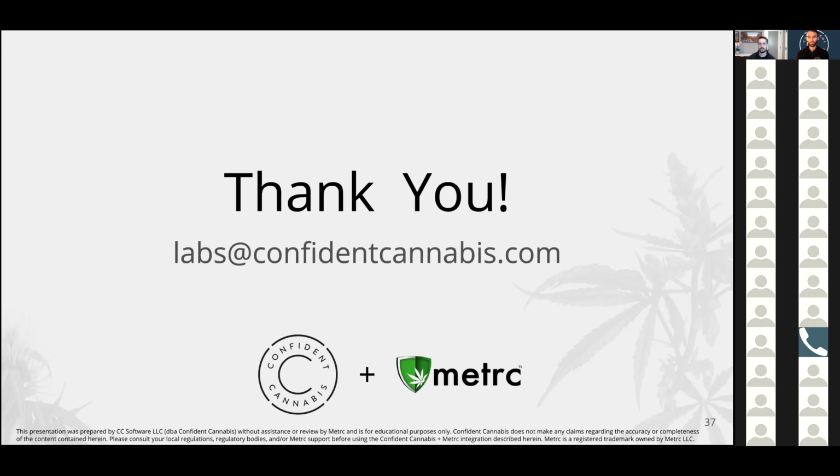Is that right? Yeah, so yes, that's correct. Although the lab would have to reject the transfer. So in Metrc, this is assuming this is a Metrc transfer. In theory, if your client's using Metrc appropriately, your client won't be able to just come drop off a sample without it being in Metrc first. And so if it's in Metrc first, then they drop off the sample, you weigh it real quick, and then you see if it's correct and accept it on the spot before they leave, ideally.